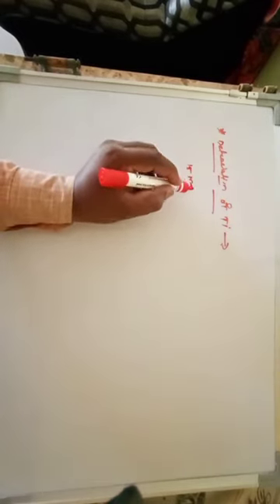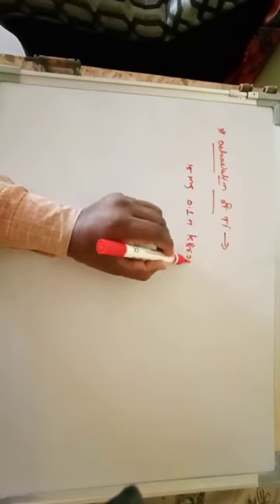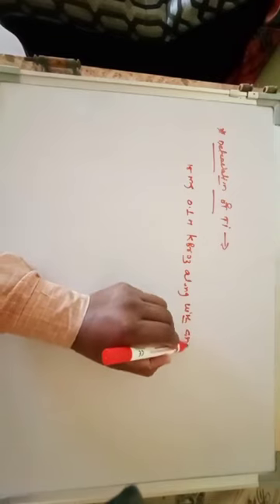Add 15 ml of 0.1 normal KBrO3, potassium bromate, which is an oxidizing agent, along with concentrated HCl. Then you have to titrate this solution with a reducing agent such as Na2S2O3. The titanium oxalate dissolved in acid will react with potassium bromate, KBrO3, and the excess is then titrated with your Na2S2O3 solution.